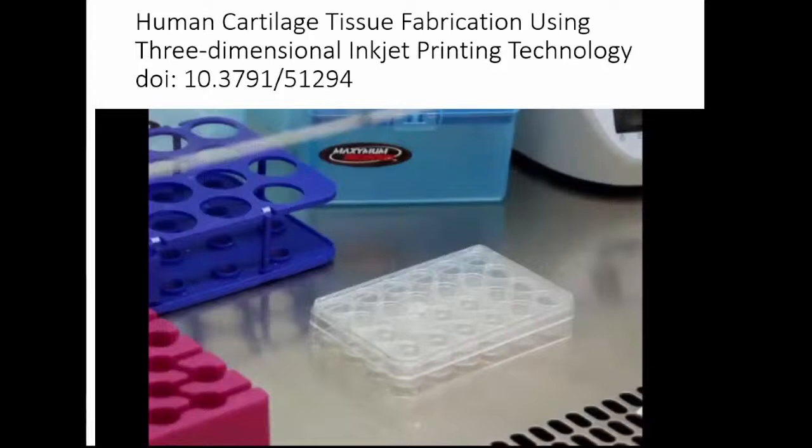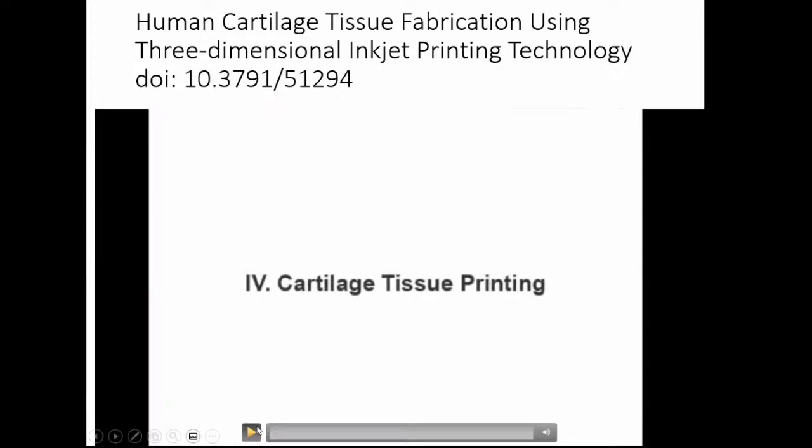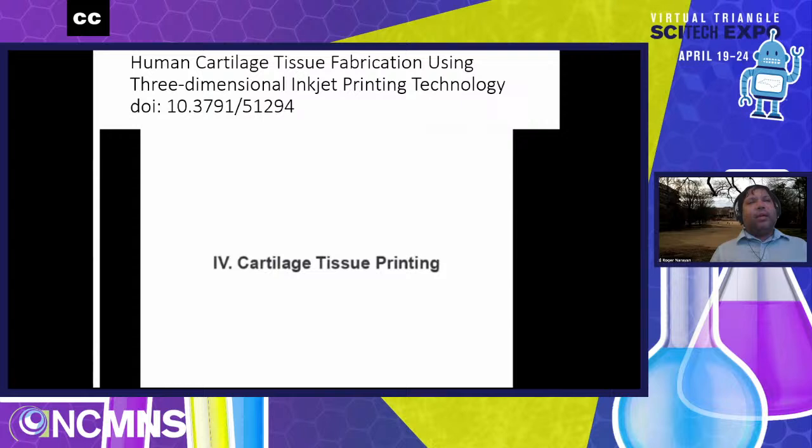So one of the things you can see from that is that essentially you use an inkjet printer. The team here used an inkjet printer to print the cells and a polymer, a sort of plastic type of material that surrounds the cells. And then they were able to, as I mentioned, in 4 minutes, get something that you could see visually, 4 millimeters tall. And then you can assume to get something as big as you need for a human treatment application, you have to print it for a bit longer.